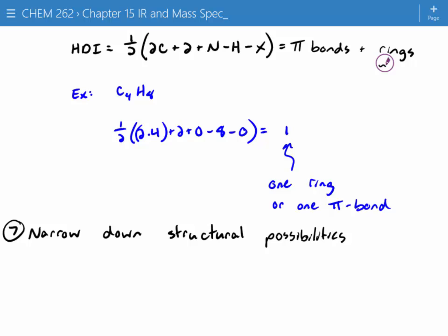Typically, when chemists make a new compound, they have to go through essentially a publication procedure where they prove to other scientists that they made that compound. They have to prove beyond a reasonable doubt that they did. So oftentimes when you pull up a chemistry publication, they'll give you an IR, they'll give you a mass spec, and then they'll give you something called an NMR, which is what we'll cover next.